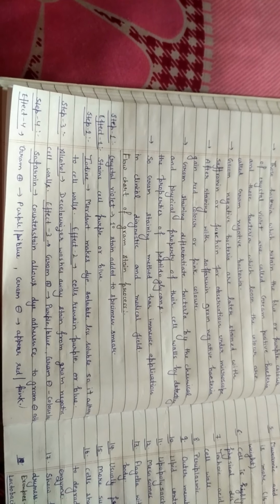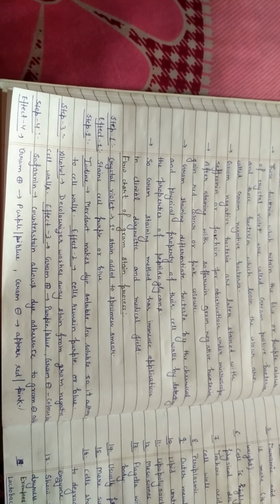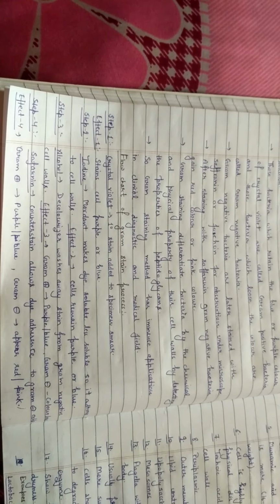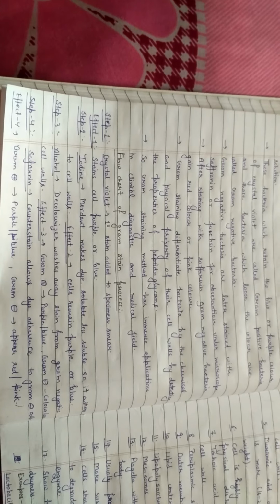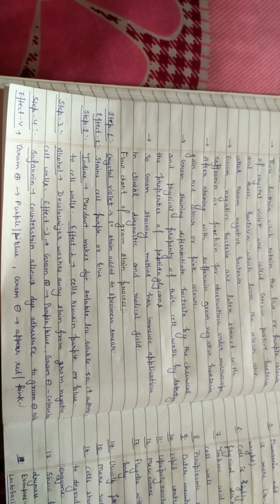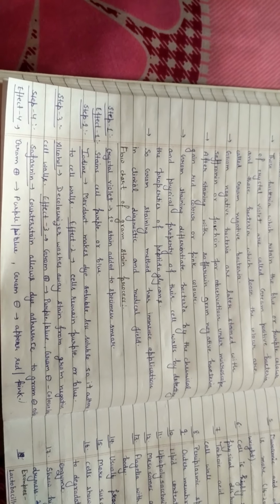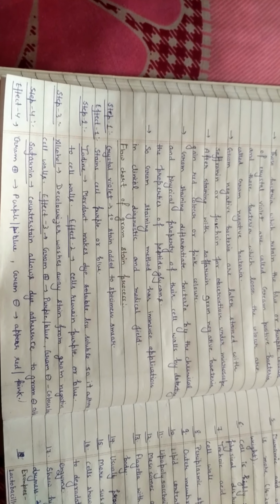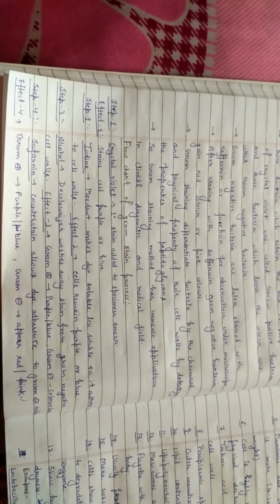So gram-negative bacteria become colorless, because the lipopolysaccharide which holds the color becomes soluble in alcohol after treatment, and all the color washes away. But in gram-positive bacteria there is a layer of peptidoglycan, so alcohol does not wash away the color in gram-positive bacteria.